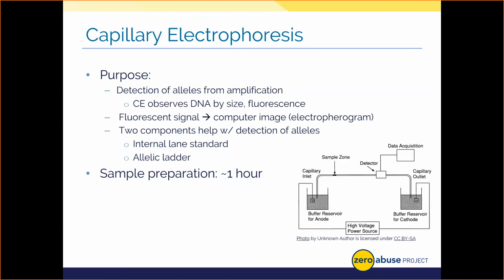In summary, then, we know the size of all the allele fragments thanks to the ILS, and we know what allele is present thanks to the allelic ladder. So we can then tell based on size and fluorescence what allele is present for a given locus for your DNA profile from the evidence. We then use rarity or frequency of a given allele to help generate the statistics used for your likelihood ratios and the like in court.